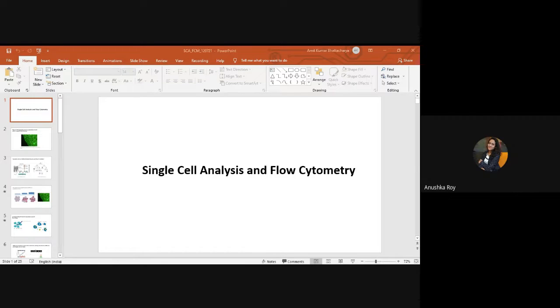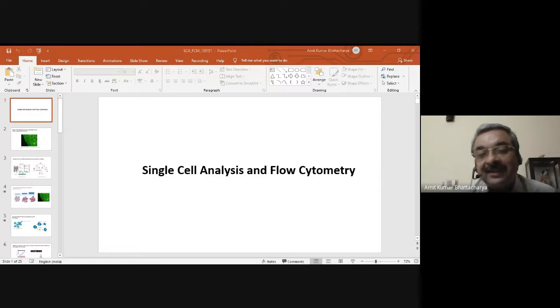Flow cytometry is used for cell counting. Each cell in a solution is passed through the laser beam, and that's how the detector counts. Exactly, so that's the keyword: each cell. The measurement happens one cell at a time.